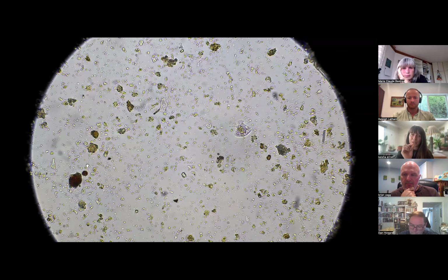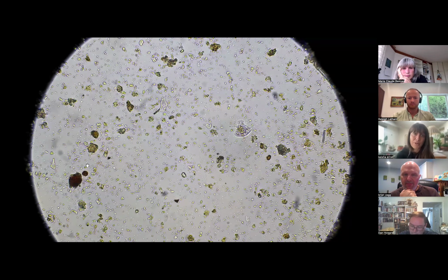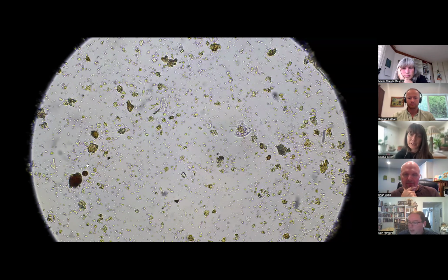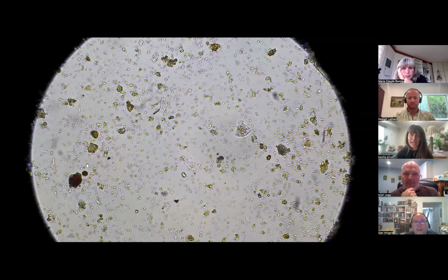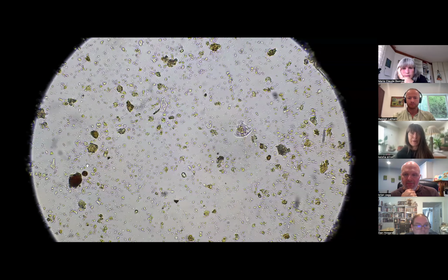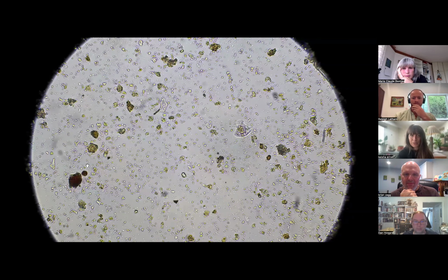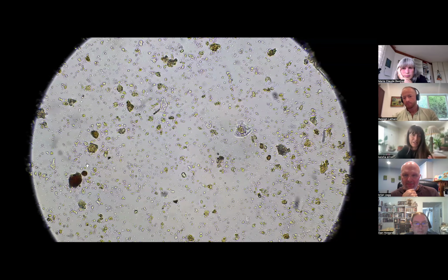And we just saw this really quickly, the first sample you put on and then this sample. So in this sample, we've observed mineral, we've observed a little bit of organic material. The color is kind of lacking. We see bacteria very clearly, and we see some microplastics that are pretty heavy. And that's what we're seeing right away. So this is really a lack of diversity.